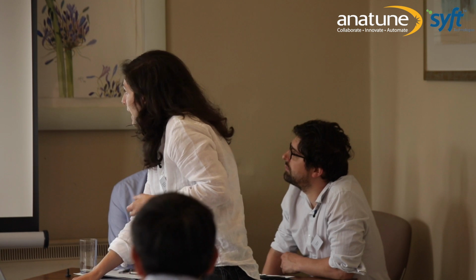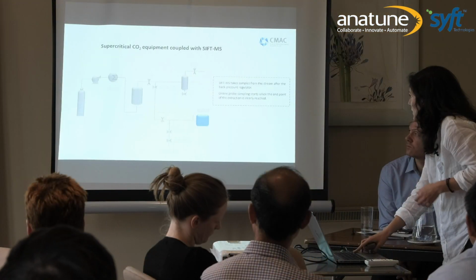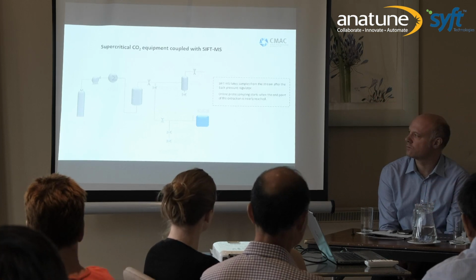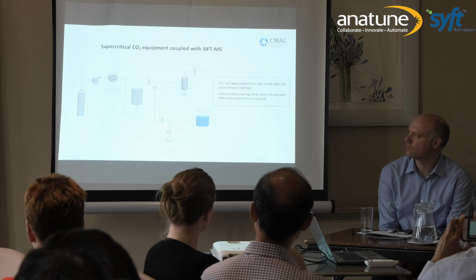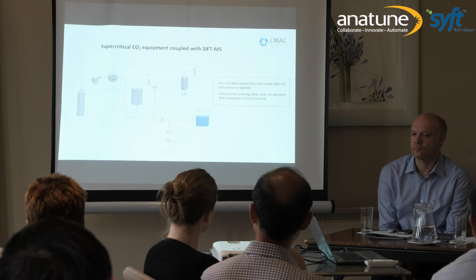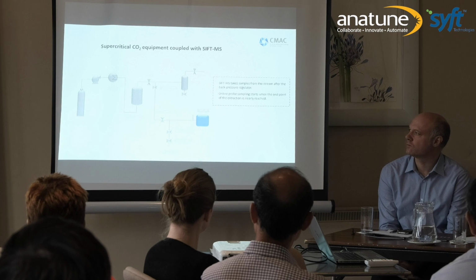So we had to modify our process, connecting a stream after the back pressure regulator to SIFT-MS. By using an online probe, we can take samples after the exit of the pressure vessel and measure the concentration changes in real time.